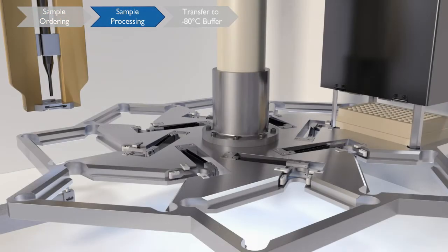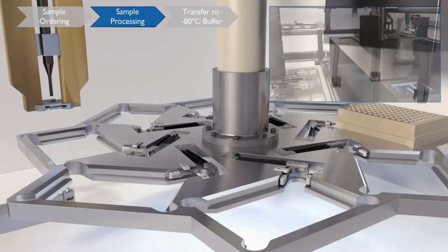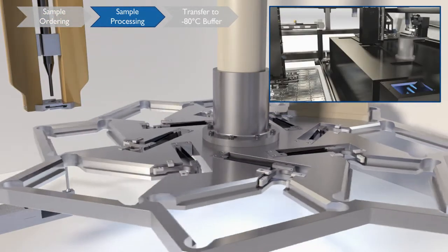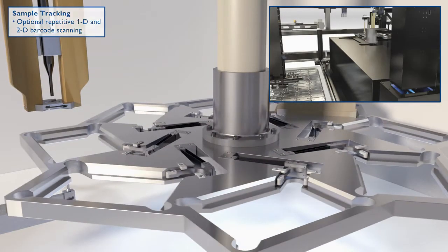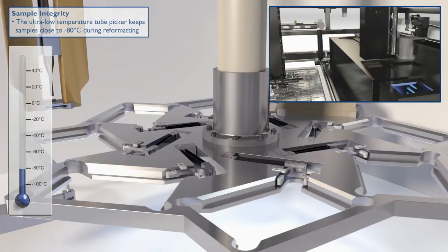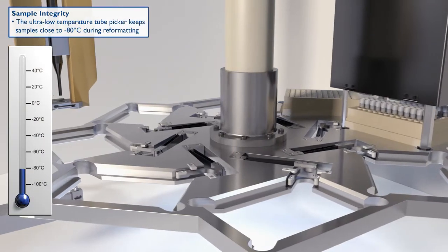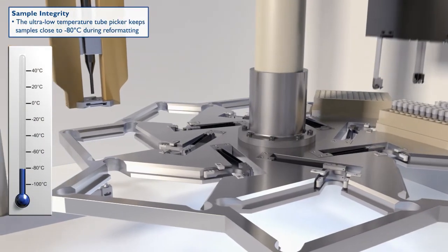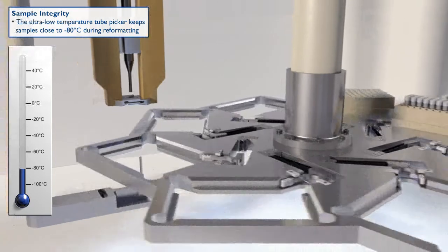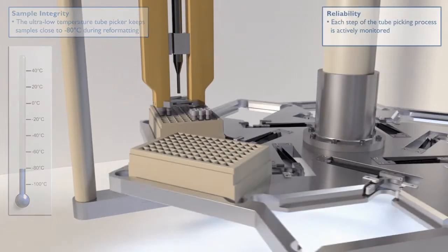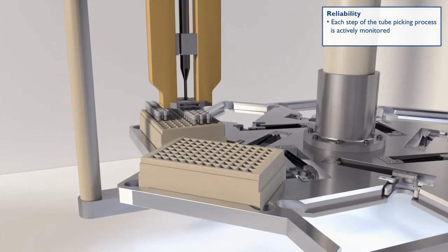A key feature in the retrieval process is the negative 80 degrees universal tube picker. Picking at this temperature keeps samples close to negative 80 degrees, eliminating warming while picking and maintaining sample integrity.